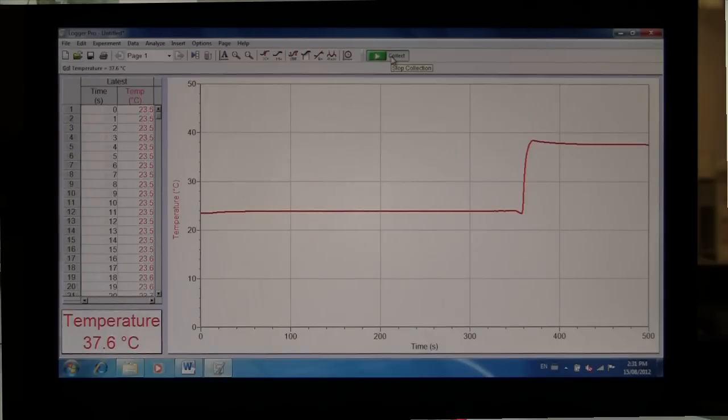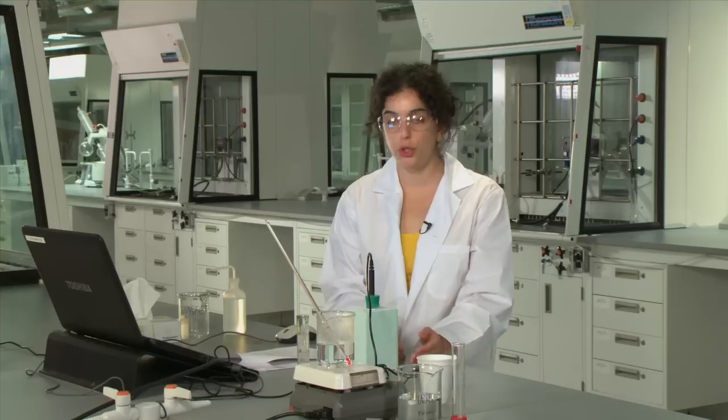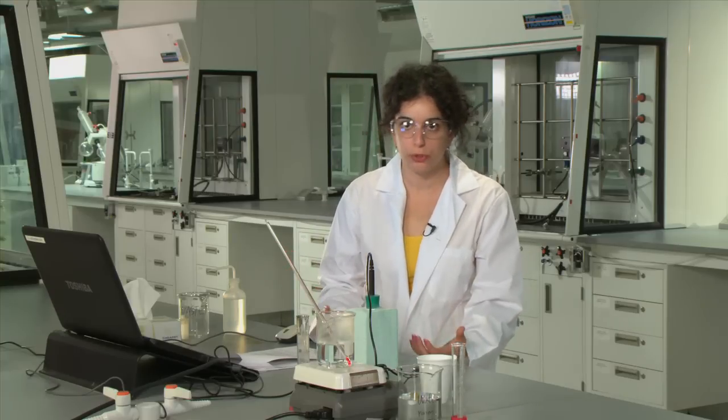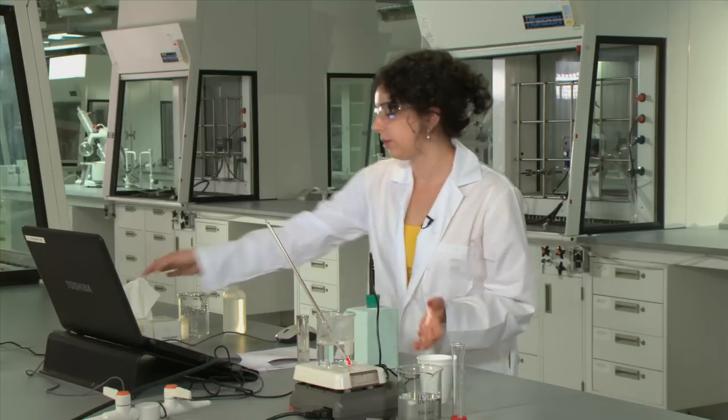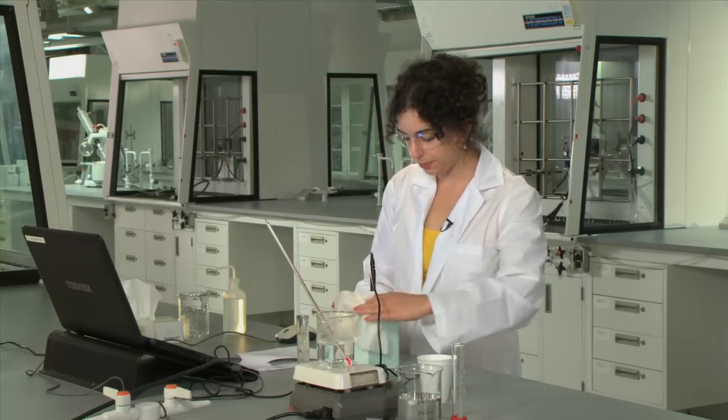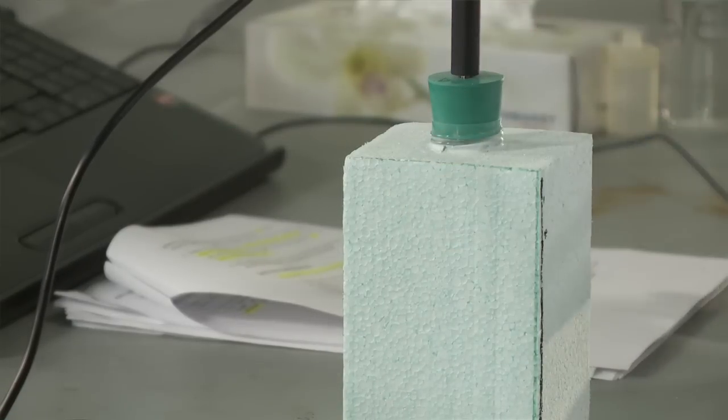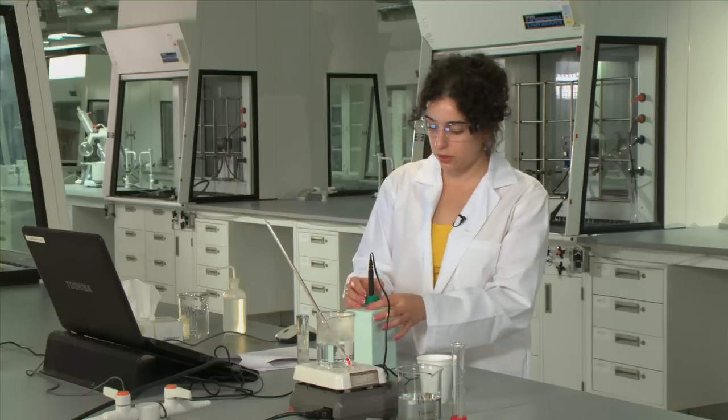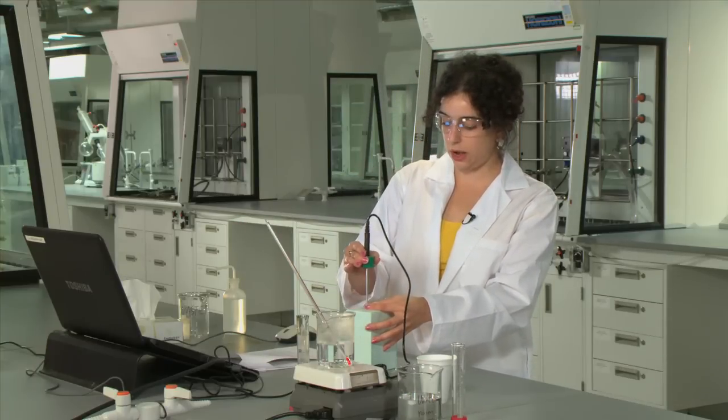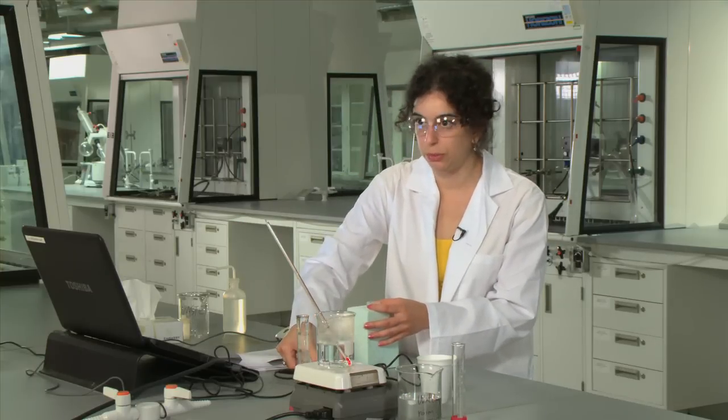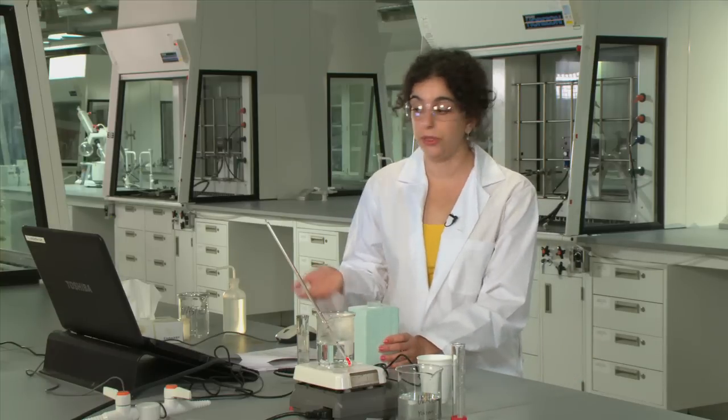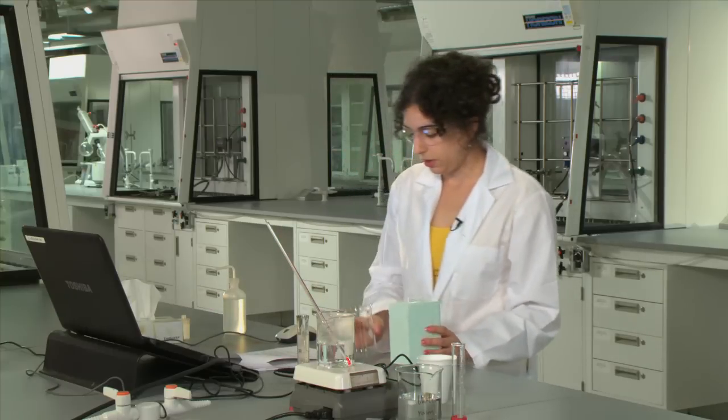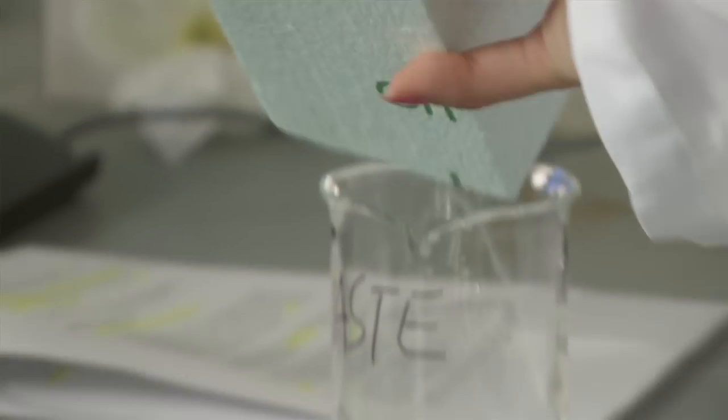And that's your first trial so you'll repeat this again two more times to get three trials to ensure reproducibility. If you happen to notice any water that sits on top of the calorimeter just wipe it up with some kleenex. In between trials you always want to ensure that you rinse out the calorimeter with some room temperature water. This will remove any leftover heat that might be contained from previous trials that could interfere with your temperature measurements.